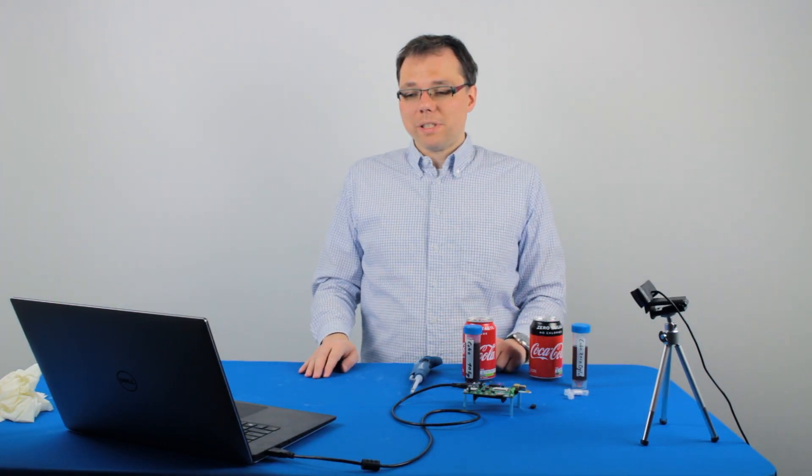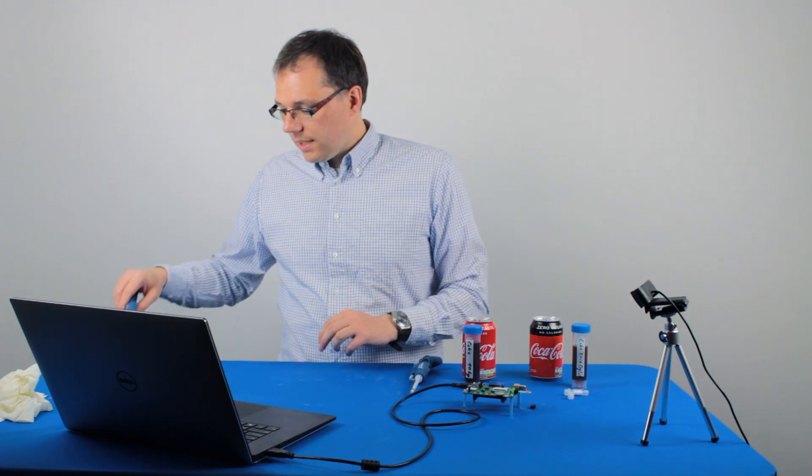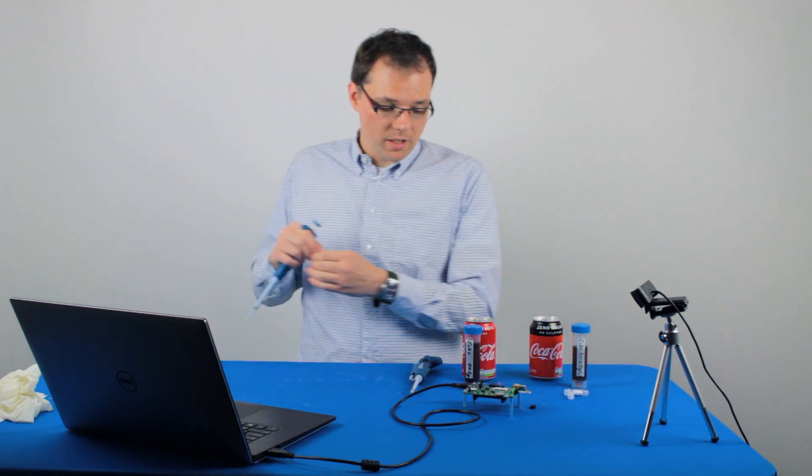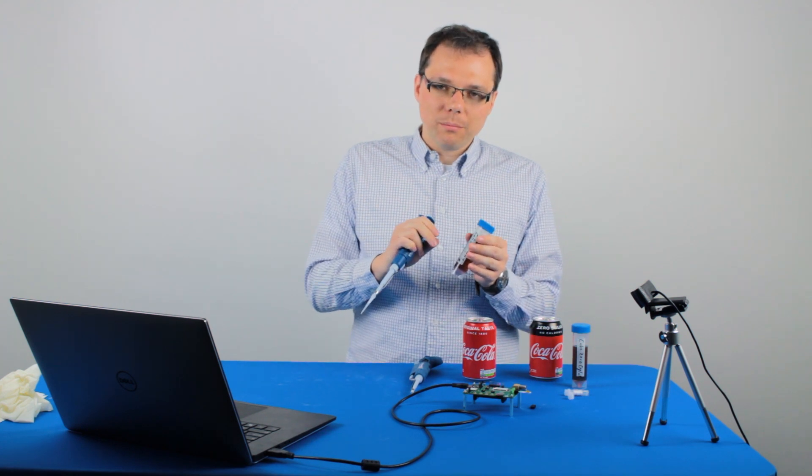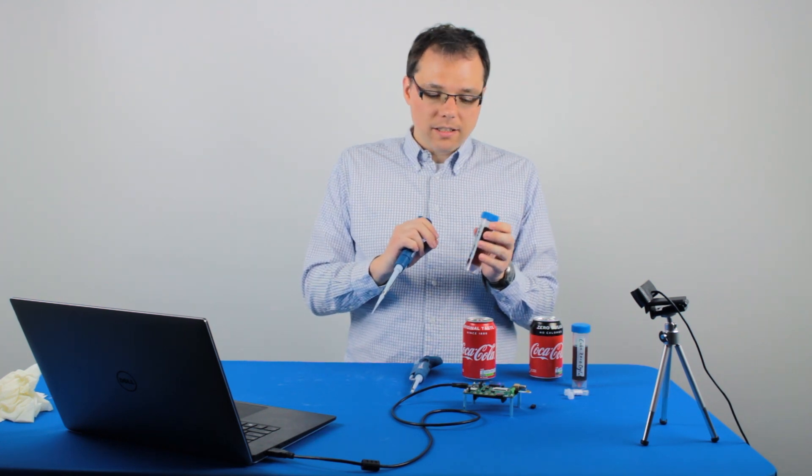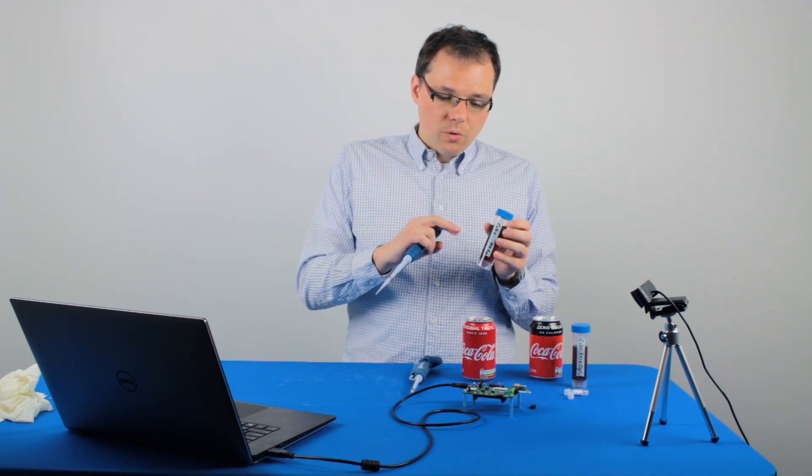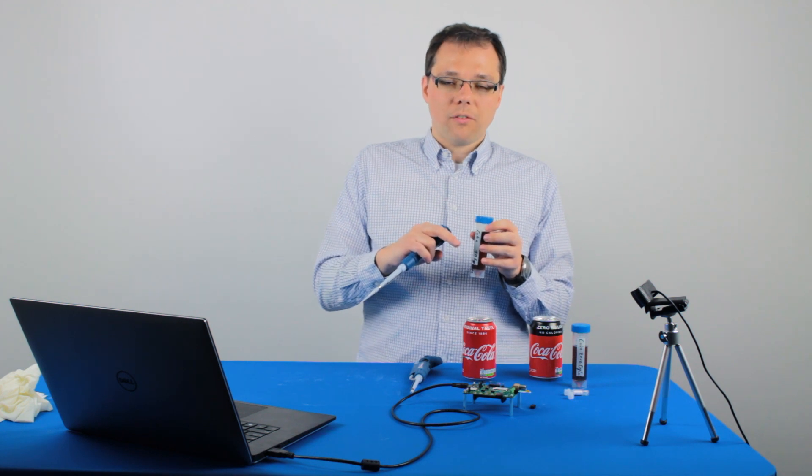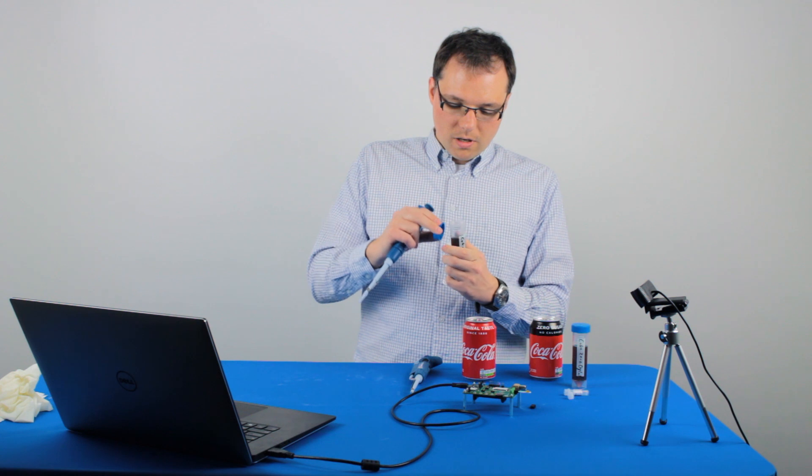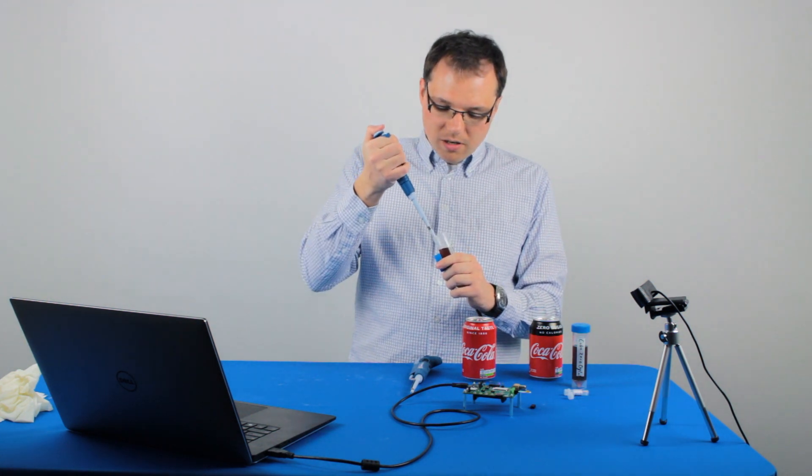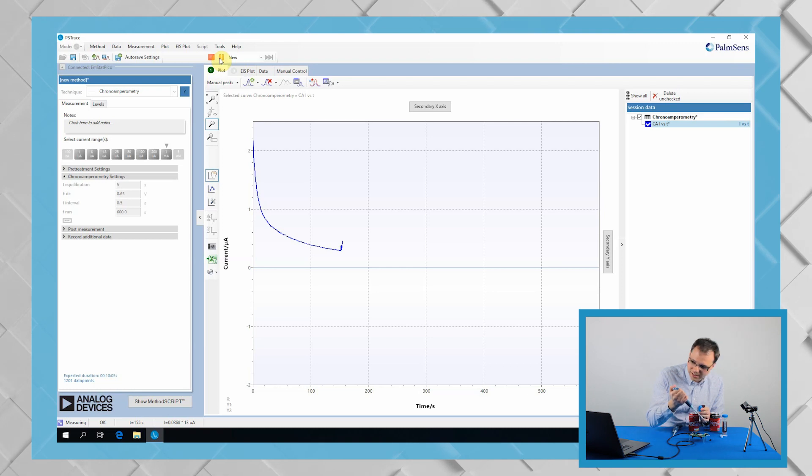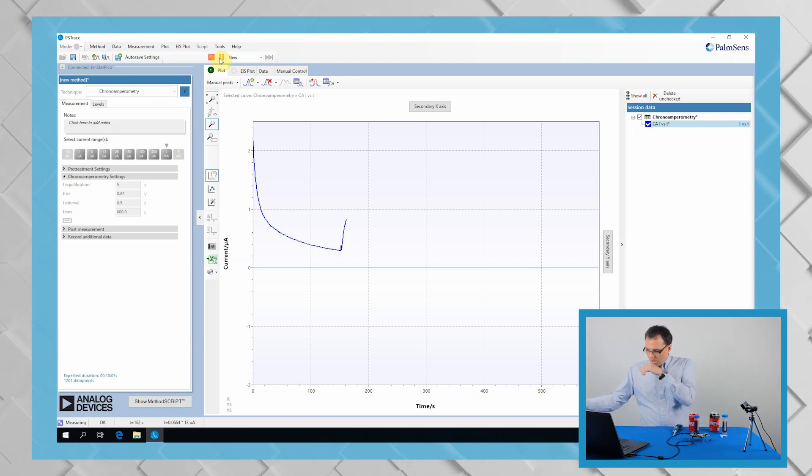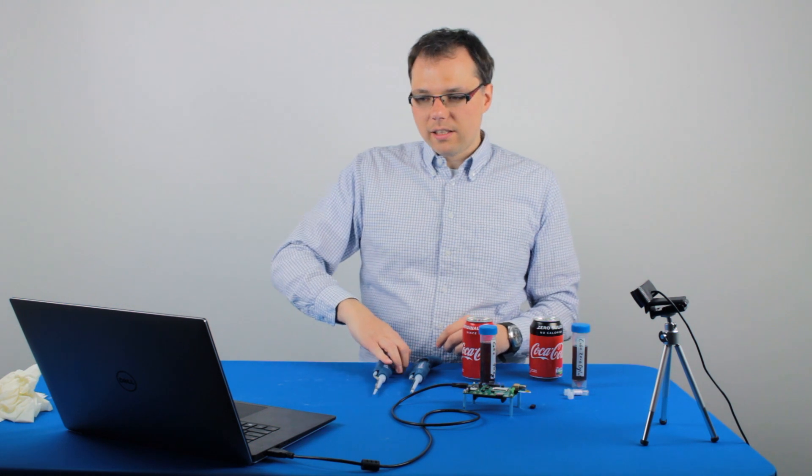Now our base current should be stable enough that we should see a clear change when we're adding some glucose in the form of the original taste Coke. By the way, I took some sample volumes and shaken these to remove the carbonic acid to make sure that there's no bubbles forming on the electrodes which would disturb our signal. Now I'm adding just 10 microliters of the regular Coke and I'm pumping these a bit into the droplet. We should see immediately a change in the signal - you see how the sensor is responding to glucose.